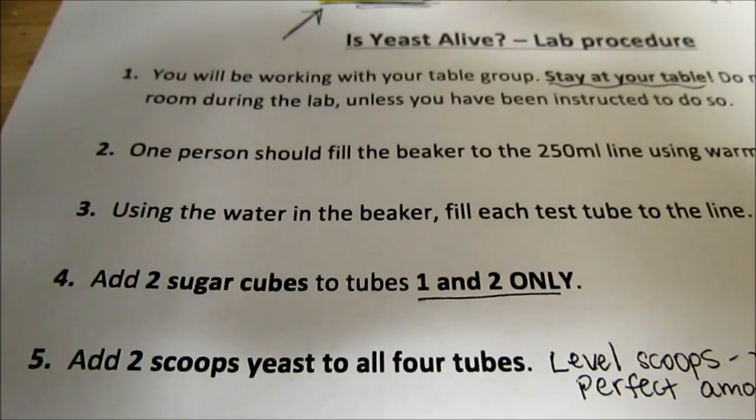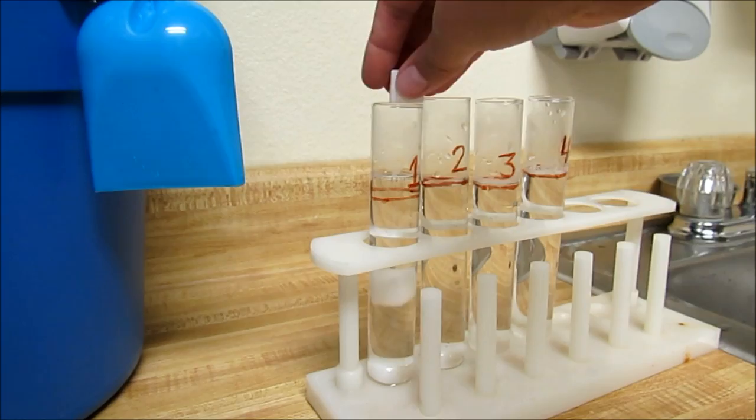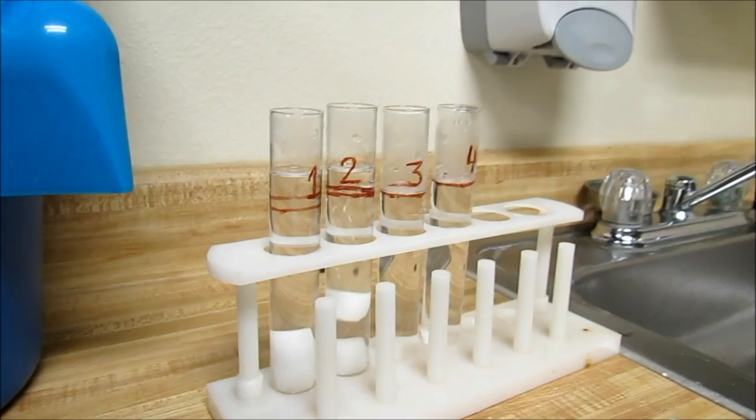So I can do the next step, which says to add two sugar cubes to only tubes one and two. So there's tube one, one sugar cube, two sugar cubes, tube two.